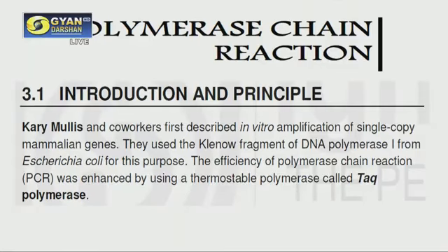So before coming into the technical part, we should know the name of the person who first described this PCR. That is Kary Mullis. He first described this amplification of a single copy mammalian gene. Like one gene is present in a very low copy, and now you want to amplify it. How will you amplify it? You can use this polymerase chain reaction. So basically it is a technique for DNA amplification.